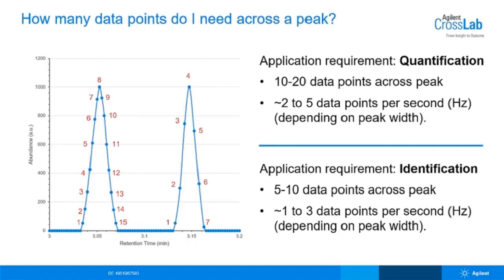First, knowing the chromatographic peak widths is important for setting your mass spec method parameters. Generally, the GC-MS chromatographic peaks range from 0.04 minutes or 2 seconds to 6 seconds wide. A test injection will give you a rough estimate of your peak widths. Note that a narrow column diameter or hydrogen carrier gas will result in a sharper and more narrow peak width.